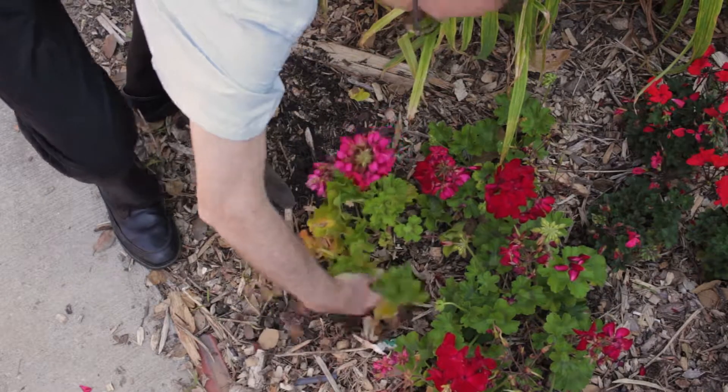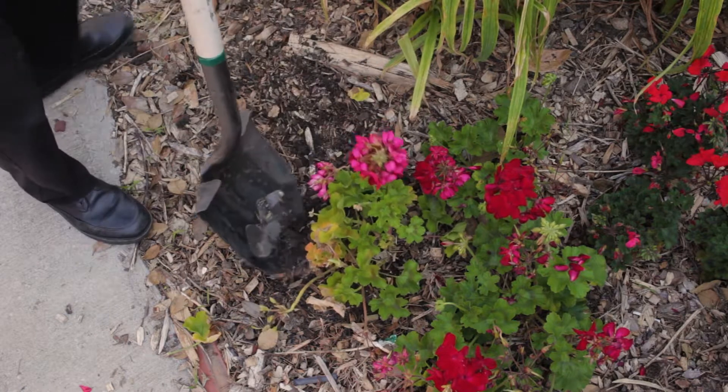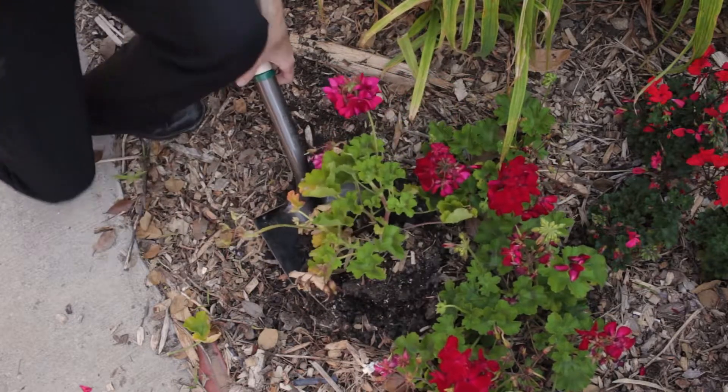Very often problems in the above-ground portions of the plant reflect conditions in the roots or soil. So we want, if possible, a sample of an entire plant. If they're very small, take several plants, again showing a range of symptoms. If they're somewhat larger, two or three would be sufficient.